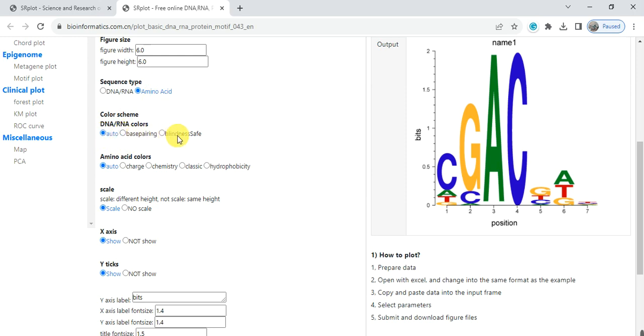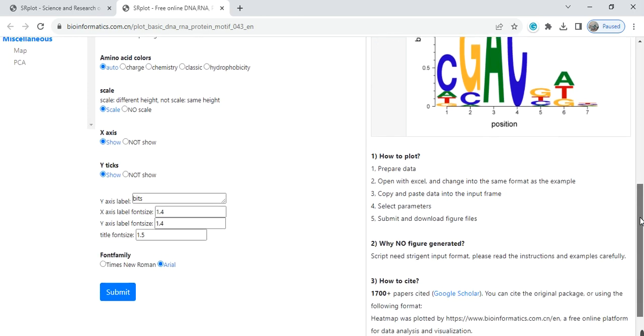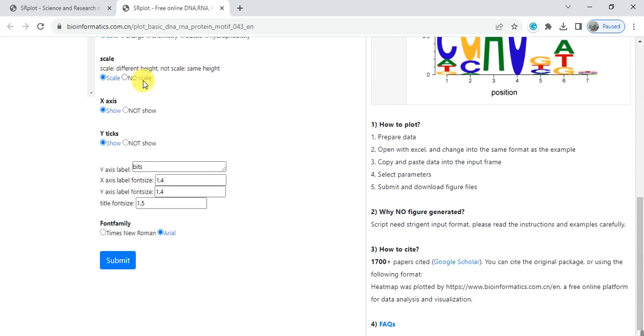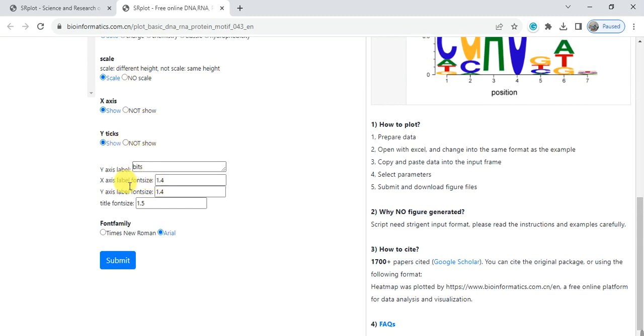Here is amino acid color which color you want to give. You can change it. Here is scale, X axis shows the legend and Y axis also. Here are some font size you can change according to your preference and then click on Submit.